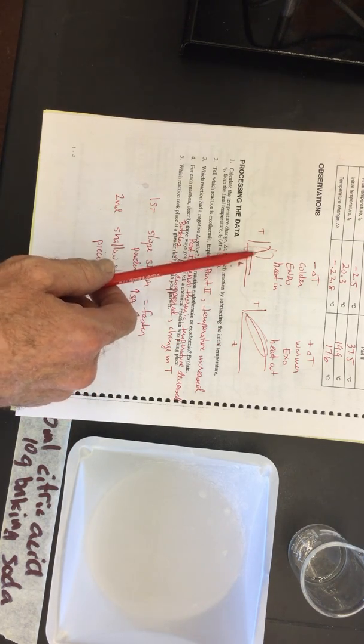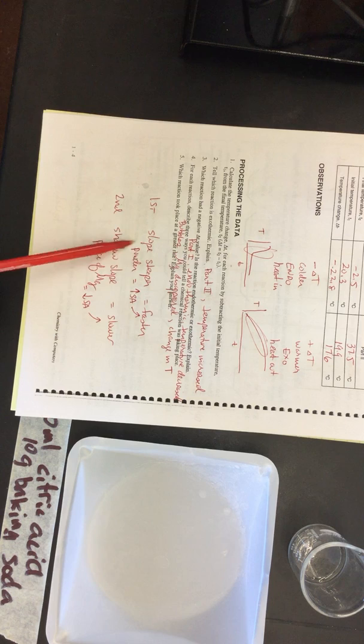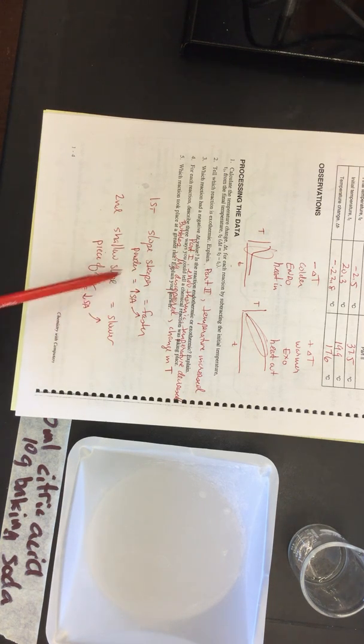This first reaction took place much more quickly because it was in the powder form. It was smaller, more surfaces for the reaction to take place, for the collision theory. The second one had a single piece of metal or a couple pieces of metal. We decrease the surface area. And so what happens there is that there are fewer surfaces to react, and therefore the reaction is going to take place much more slowly.